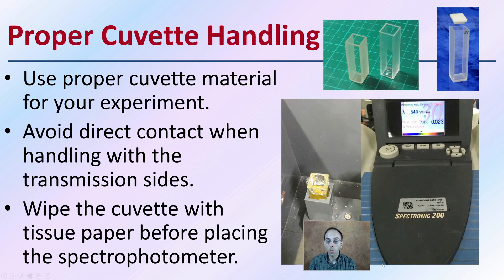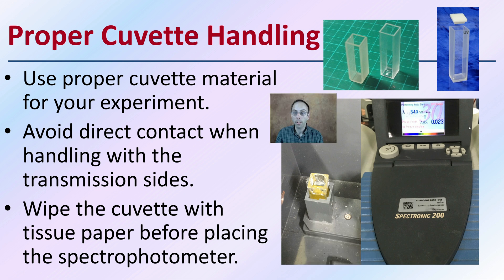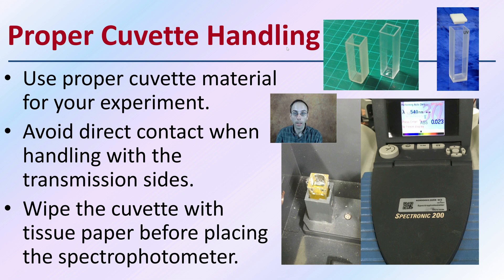For proper cuvette handling, keep in mind that because this is such a precise procedure, we want to be very careful in how we're handling our cuvettes. We want to ensure we're using the proper cuvette materials, and we also want to avoid direct contact when handling the transmission sides. Looking at our cuvette example, we can see there are two clear sides and two more opaque sides.